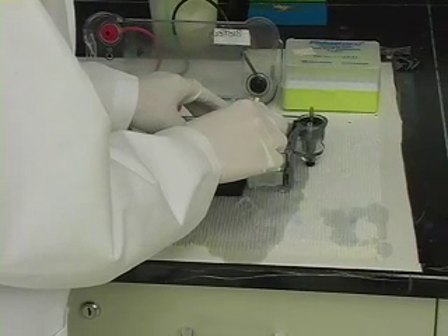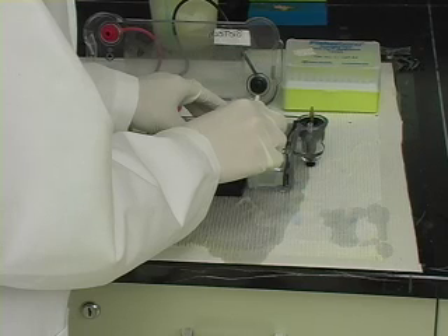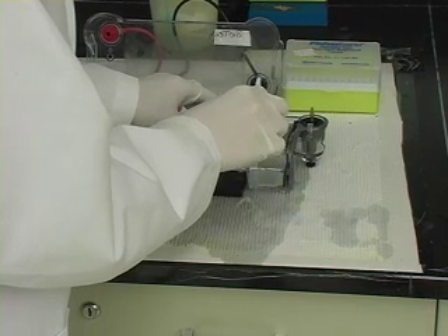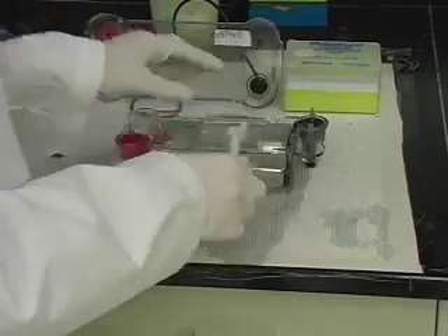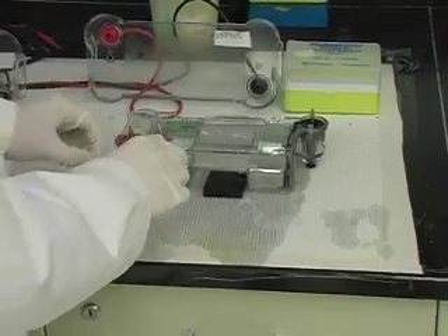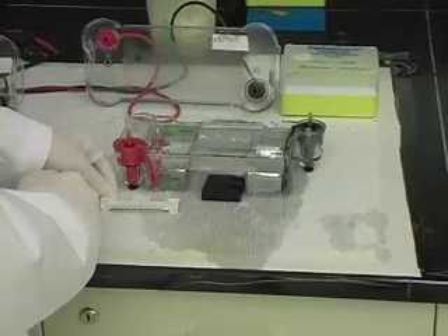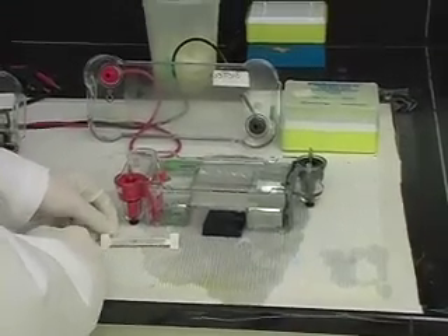When the agarose has hardened, carefully remove the comb from the gel. Rinse the comb and pat dry. Remove the rest of the pieces from the mold as well, but keep the gel in its tray. Fill the gel box with running buffer to the fill line.